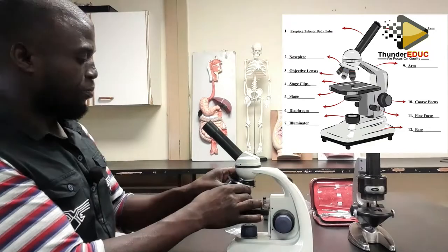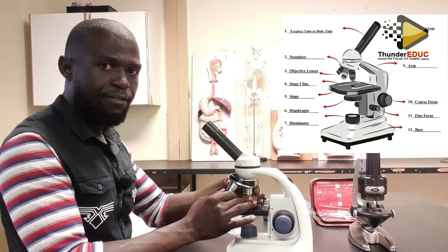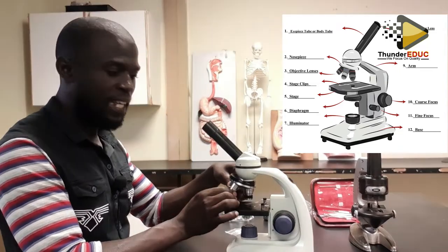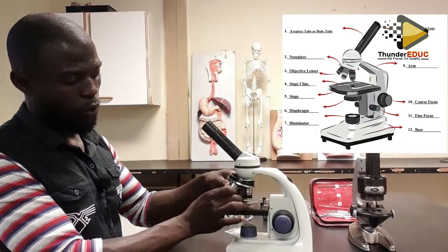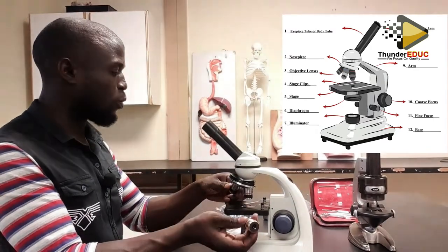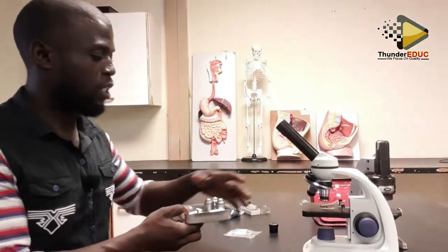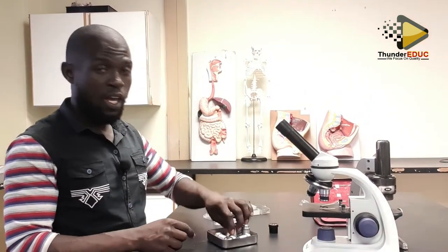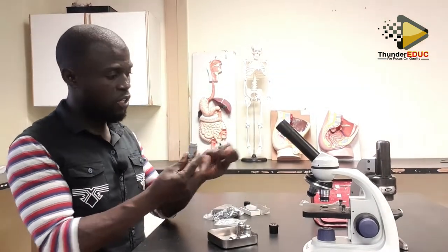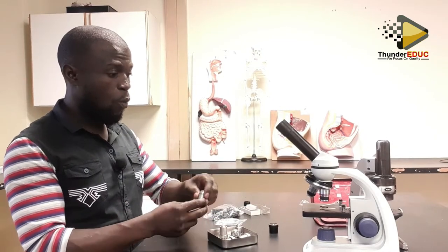Then it has what you call the objective lenses. These lenses can be moved off and on, and then you put another lens which you want to use. Here I have a number of objective lenses. Depending on which objective lens I want to use.